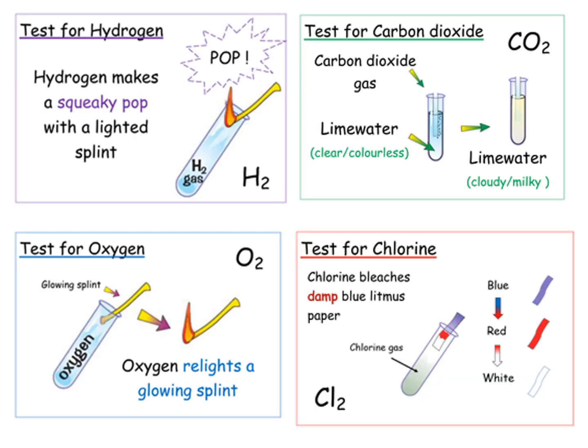There are 4 gases you need to recognise the tests for. So if you had a chemical reaction and you saw bubbles of gas, there are 4 gases that you would need to be able to test for and recognise the test for.